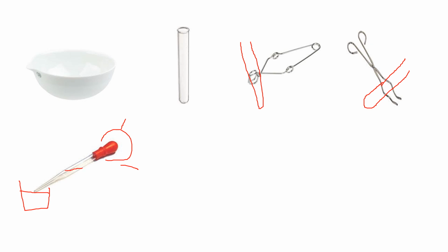Then once you press here, you can release small drops. Have you ever used the dropper? I hope you tried the pH measurement in the lab. Do you remember, at that time you used HCl and sodium hydroxide, drop by drop, drop by drop. So we use the dropper.